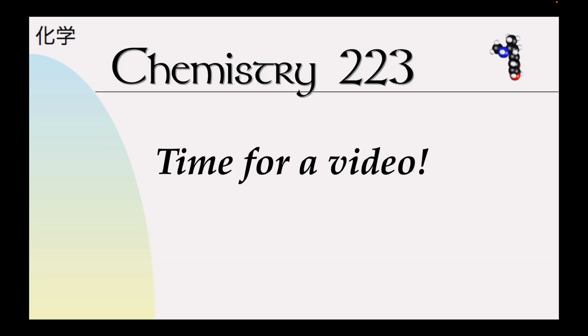Okay, at this point, I'm going to show a quick video that shows what the lab will actually be like. It shows some setups and the titrations. They go pretty fast, like I said. It's a lot different than the other labs we've done.